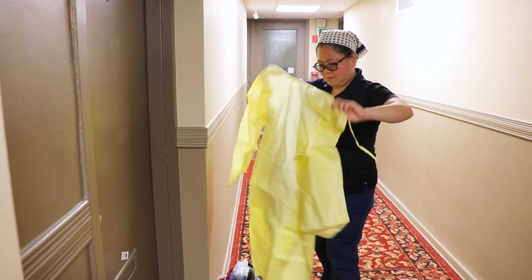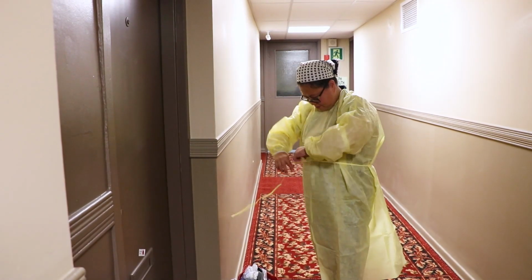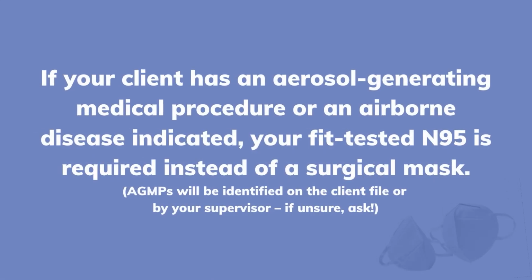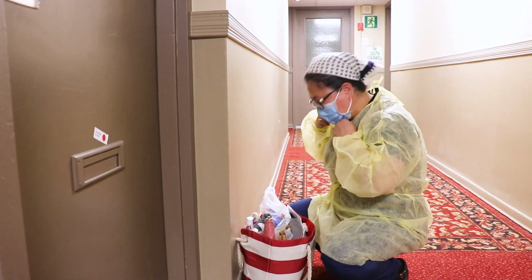When the client screens positive, 4-point PPE for the contact droplet precautions are required. This includes your surgical mask, eye protection, gloves, and protective gown. If your client does not have a surgical mask of their own, please provide one from your supply.